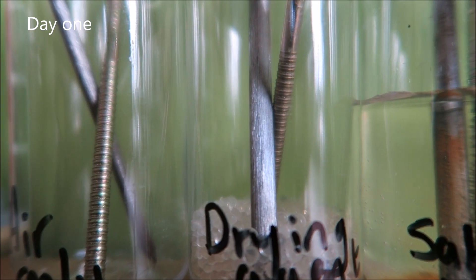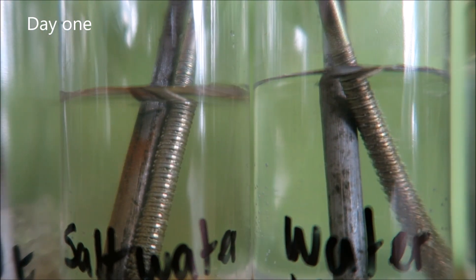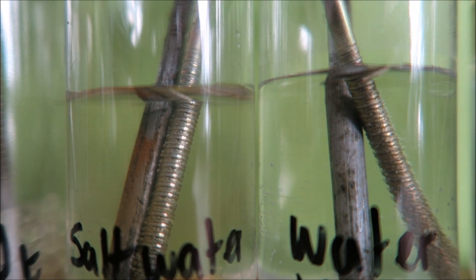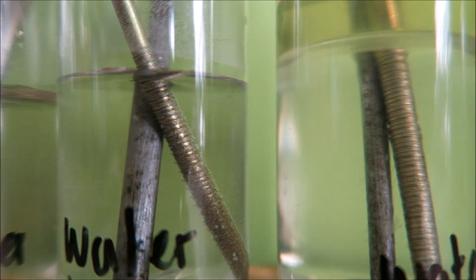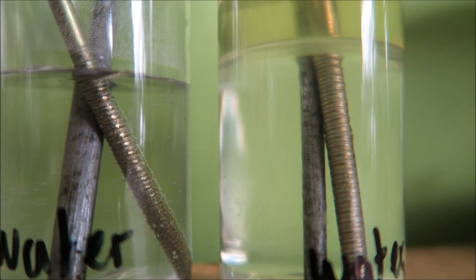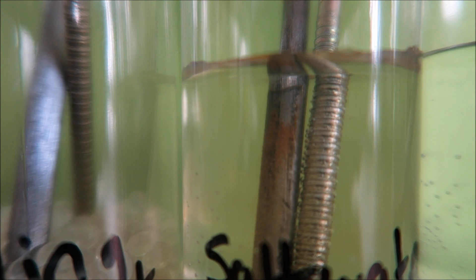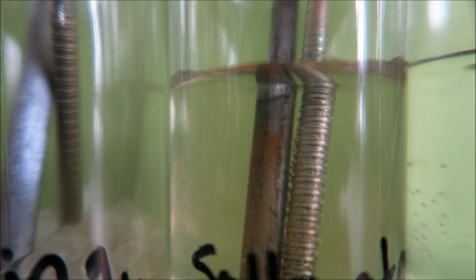Day one and we can see that the air and drying agent look pretty clean. But the one in salt water and the one in water have already started to go quite rusty. This is quite a surprise - I didn't think they would go rusty this quickly. The one in salt water is really starting to go quite rusty, whereas the galvanised nail in there isn't.